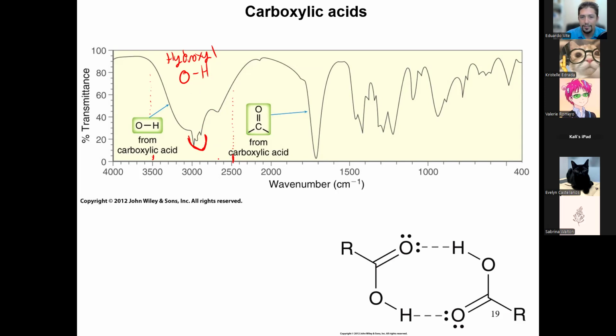What are those peaks right there? We've been seeing them everywhere. They're in every molecule. Can't move on until someone gives me an answer. What are those peaks right there around 3000?